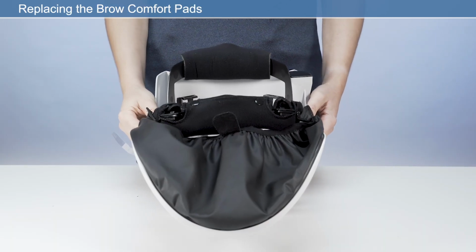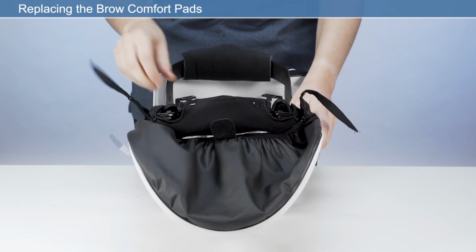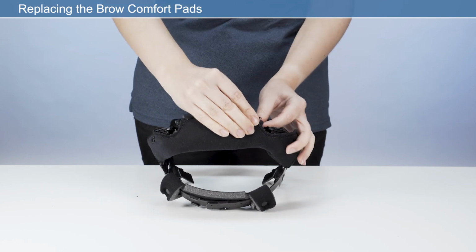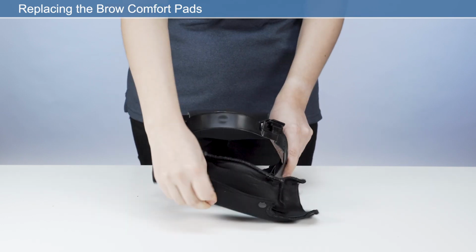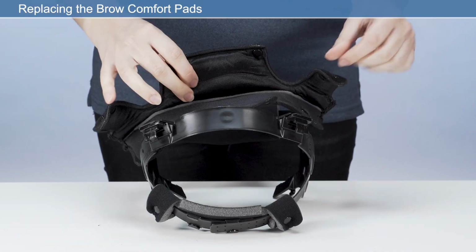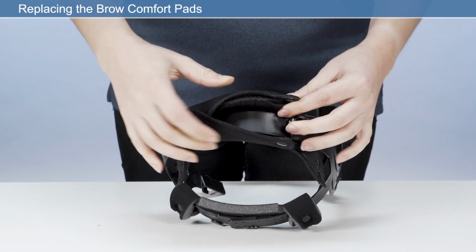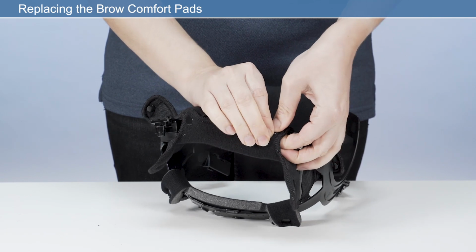Replacing the brow pad. Remove the brow comfort pad by pulling away from the hook and loop retaining strip. Place the new brow pad onto the hook and loop strip. Ensure the brow pad is placed centrally to the front of the headband so that it sits equally left and right to the user's head. Ensure the perforated side of the brow pad is facing the user's skin.